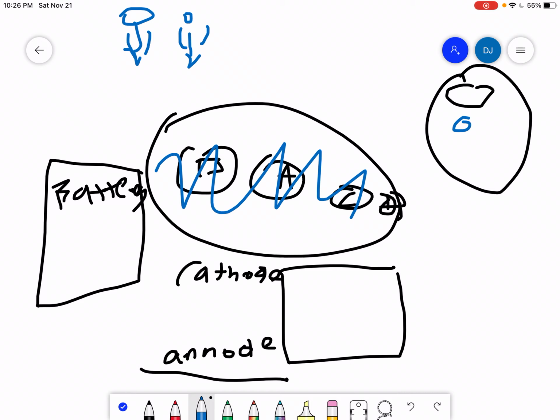Obviously, if you're trying to move through a confined space or a hole, being smaller makes it an easier job. So if we note that the smaller fragments will pass through the gel more quickly, and that DNA is negative and so attracted to the anode side, then all the fragments closest to the anode will be smaller than the fragments closer to the cathode.